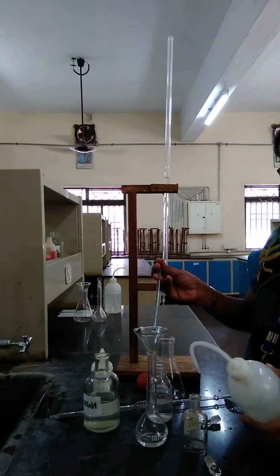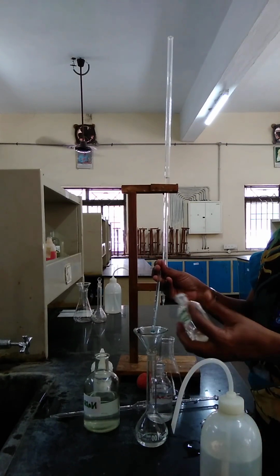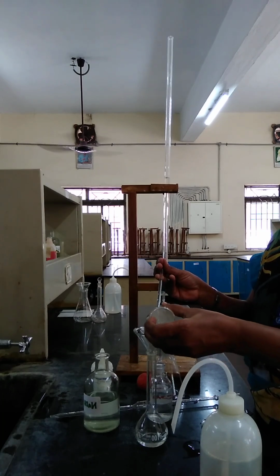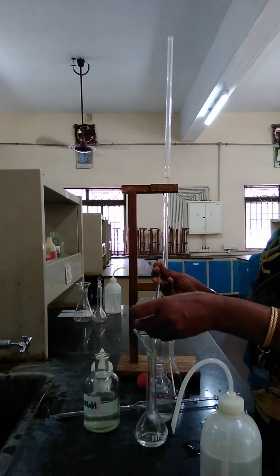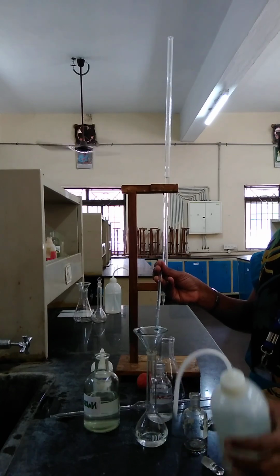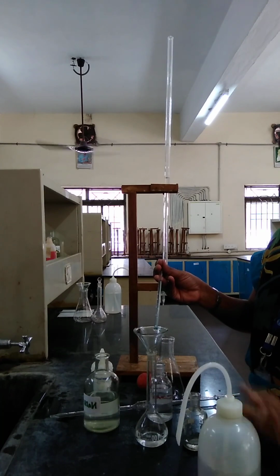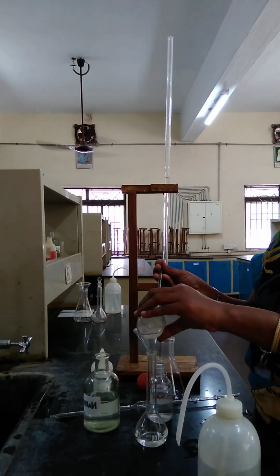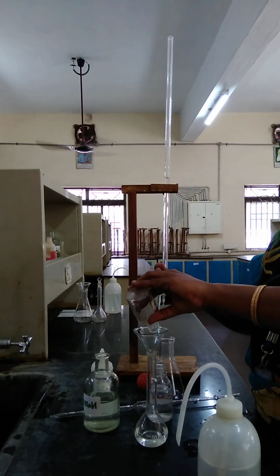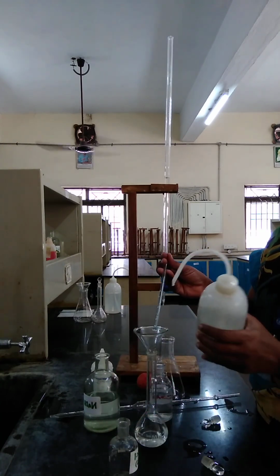The amount of sample given may be 9 to 12 ml, but we are going to make up to 100 ml. Even a single drop sometimes may lead to 0.3 to 0.4 ml, so definitely it will give the wrong answer. For that reason, wash the reagent bottle 2 to 3 times with a little quantity of distilled water.